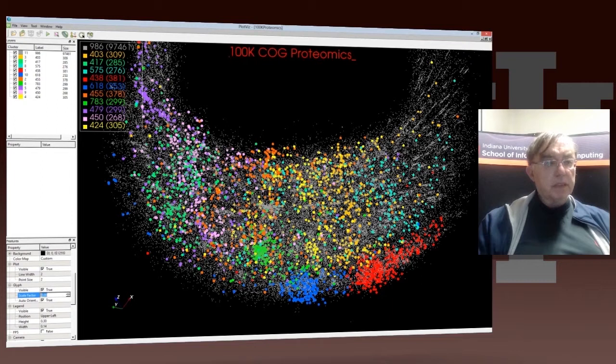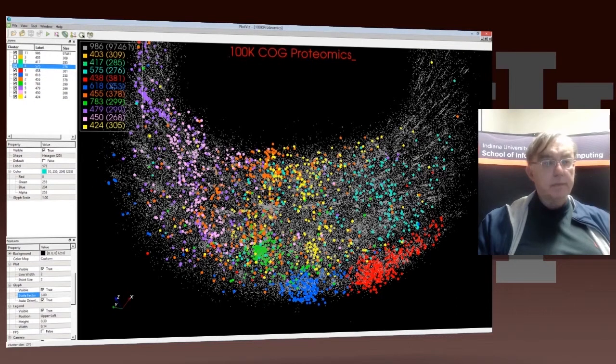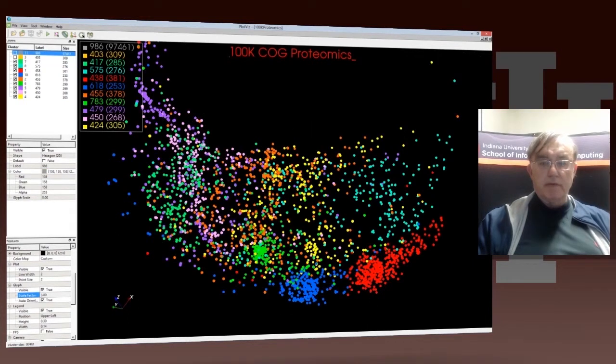Notice you can get rid of clusters up here, this tick mark is for visibility. So we could get rid of the sort of orangey-brown thing. Or just get rid of that cluster there. That's a very spread out cluster. And then let's get rid of cluster seven. That's also pretty spread out. We can even get rid of the default. We've seen that, so it may be even clearer.